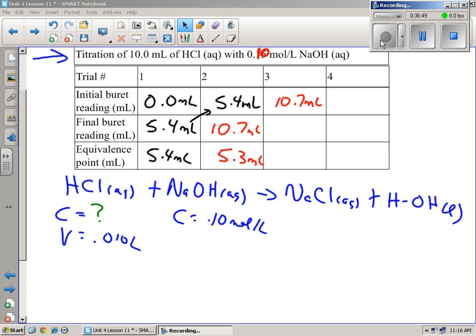That one, it took a lot of shaking for the color to disappear, so you know that it's getting very, very close. Okay. You're going to go drop by drop here, and since it's so close, I'm going to have to do probably 1 drop and stop kind of thing. So just got to turn this ever so slowly until you see a drop coming out, and then turn it off kind of thing. Shake it in there.